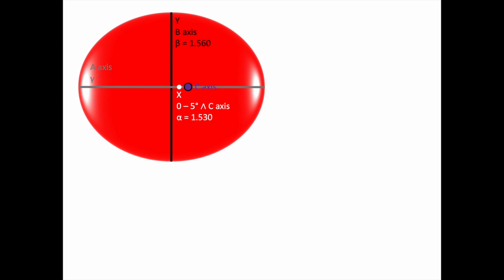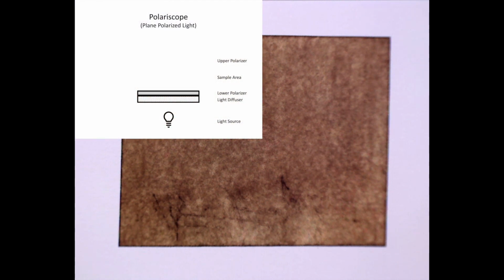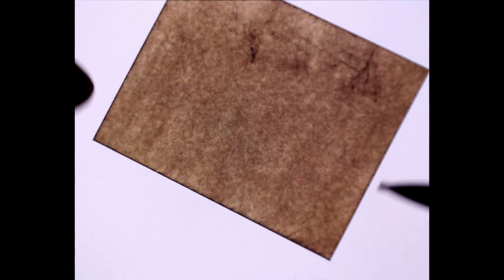Now let's take a look at our Phlogopite mica sheet and translate all our theoretical understanding of our optical indicatrix into practice. Here we have our Phlogopite mica sheet, and we're currently viewing our specimen with transmitted plane polarized light. We'll first rotate our sample in plane polarized light to see if we can see any pleochroism. This particular specimen is rather boring. These are all natural crystals, and so there is some variability here. However, you'll see in a moment why this particular specimen is not displaying pleochroism.